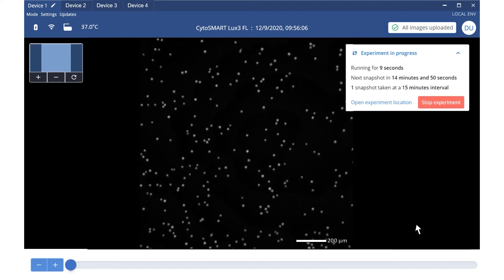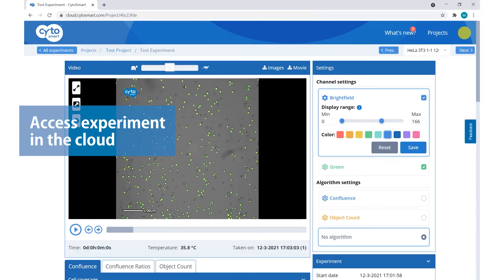Keep track of your experiments anywhere and anytime by logging into the Cytosmart cloud.